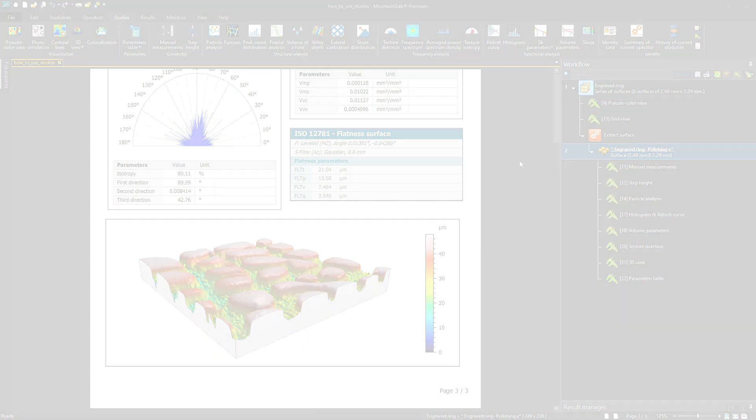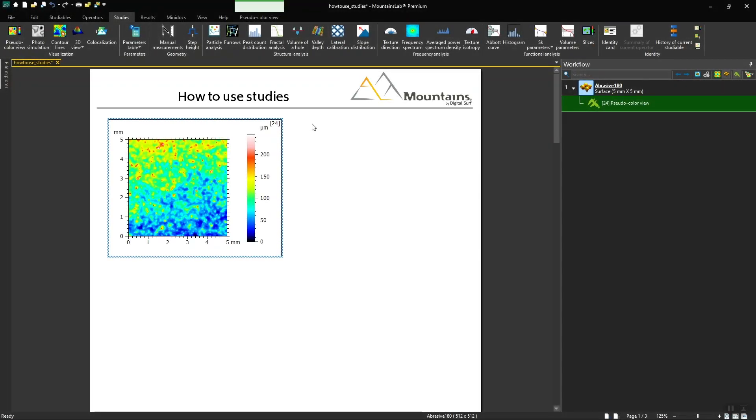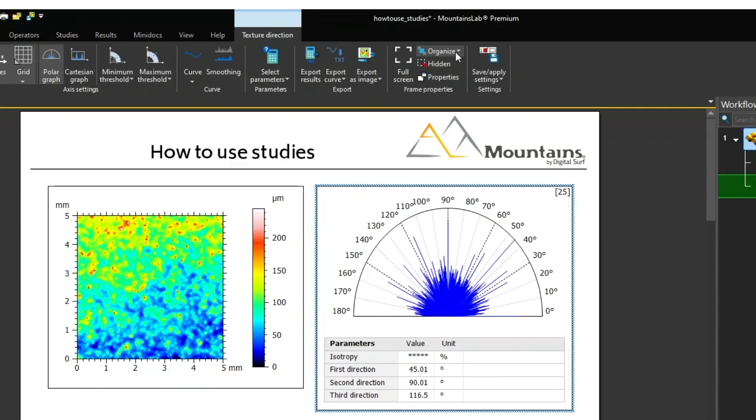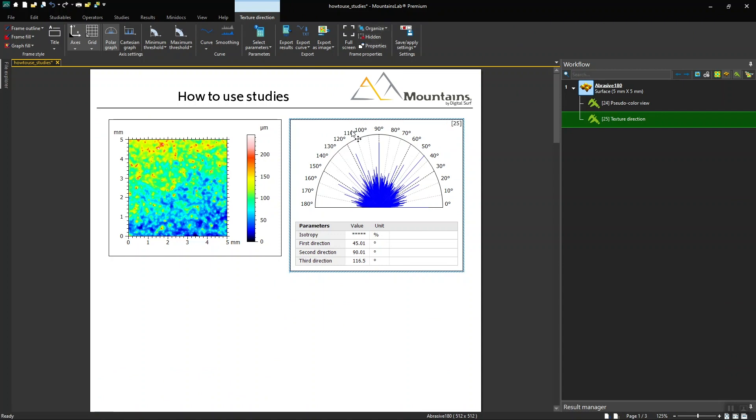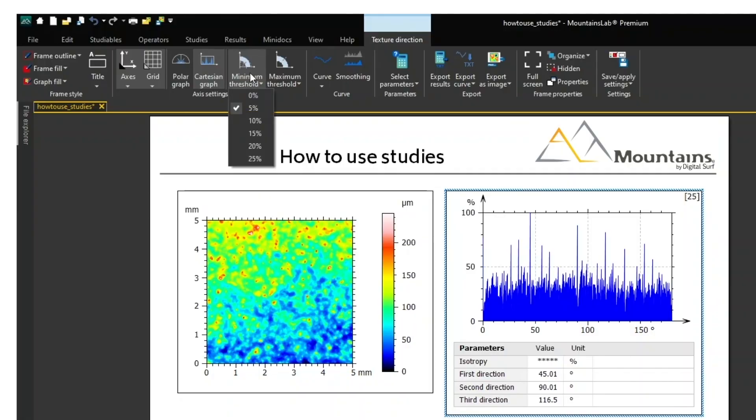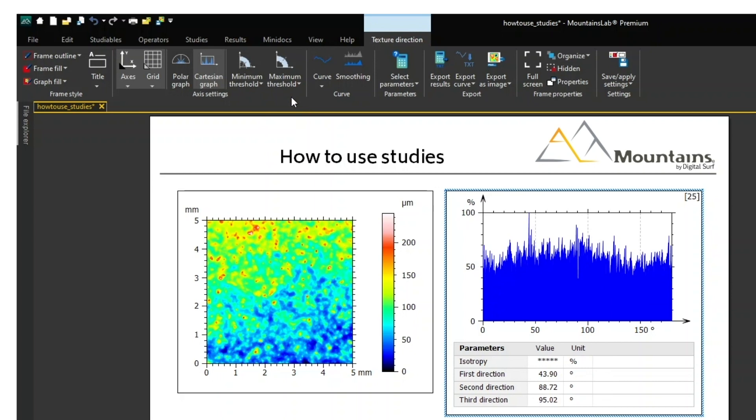Here's how they work. I select a studyable, then choose a study to apply. This study appears directly in the document and can then be customized via the contextual tab, which appears at the top of the interface in order to obtain relevant results.